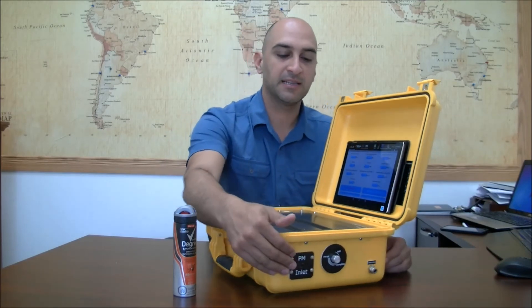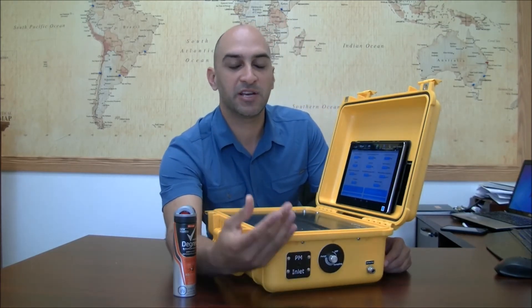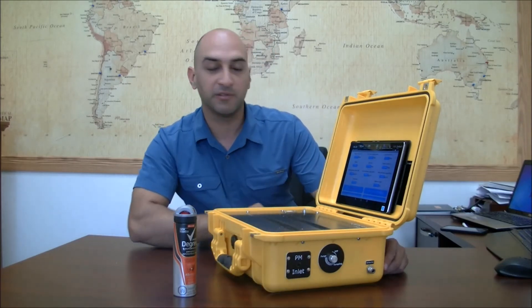If I just rub my fingers in front of it, the skin particles generated from the friction — you'll see the PM1 go up to 31.